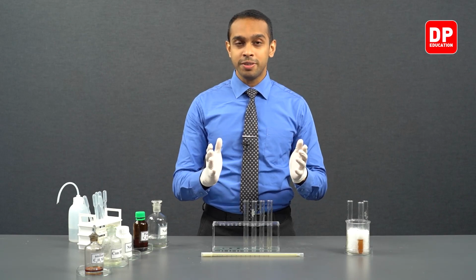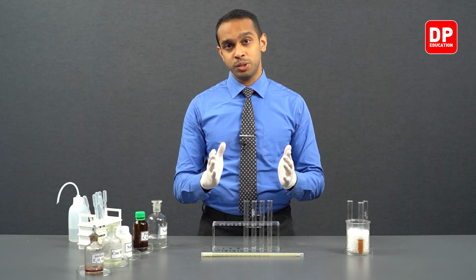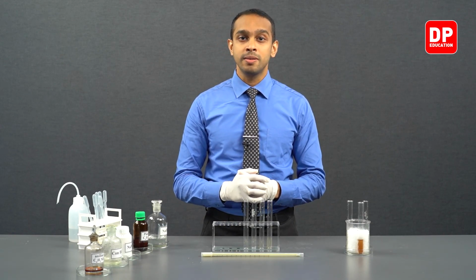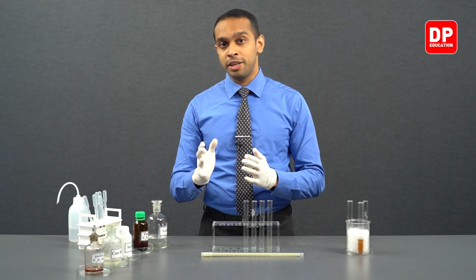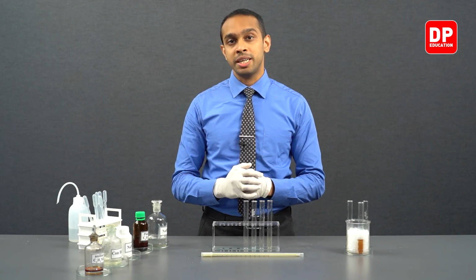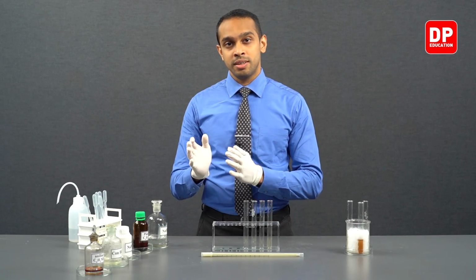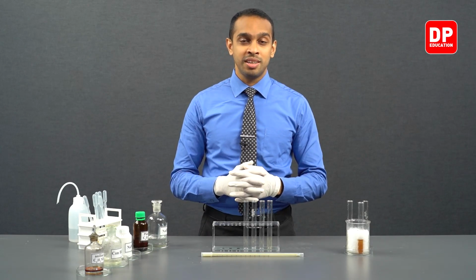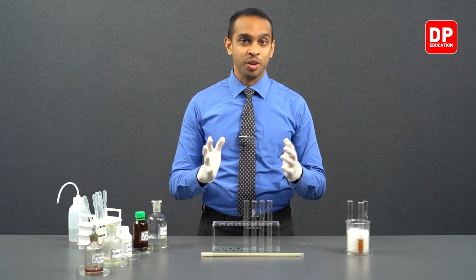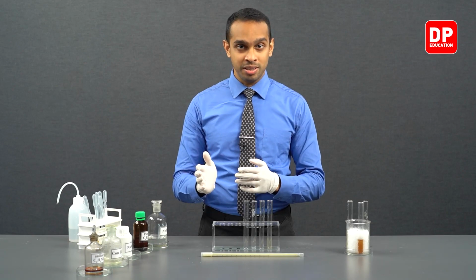So after producing benzene diazonium chloride, while keeping this solution between 0 to 5 degrees Celsius, we are going to react it with alkaline phenol solution. So in the alkaline medium, we are going to see benzene diazonium chloride react with phenol to produce an azo dye, which is going to be orange in color or red in color. So color may range between orange and red.